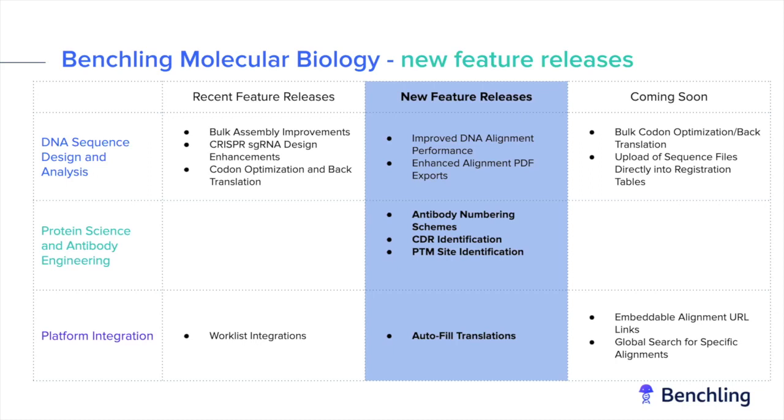So up until now, we've already delivered a few improvements to our DNA alignments tools, such that it can now take in larger alignments with more sequences and sequences of longer length. This is the first of many performance-related improvements. We have some plans down the line to integrate additional algorithms that would allow us to extend the capabilities of our DNA alignments tool to offer support for additional workflows, such as contig assembly, for example. I think there was a question there.